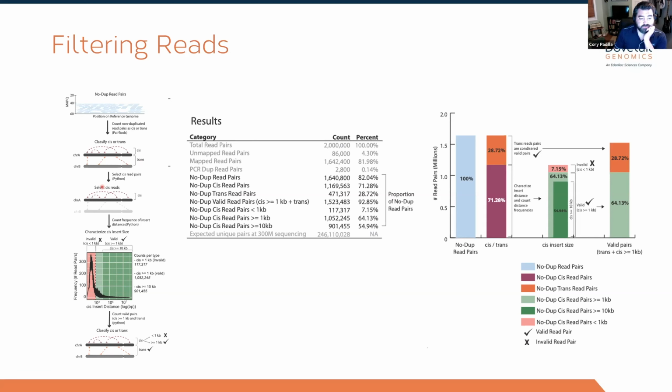So we take these cis reads, again, this is a part of pairtools, that then basically just counts how many read pairs occur at less than 1 kb or greater than 1 kb. And then you could add some other cutoffs here that just basically say, okay, we're going to ask how many cis reads are greater than 10 kb. Whatever your definition of long-range information is, you can definitely incorporate that into this question. Here we're just using 10 kb, and as you can see, here are the counts. And as the distance gets longer, that tail kind of forms.